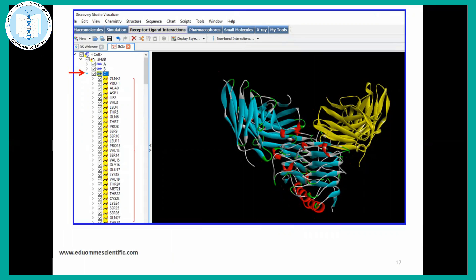In chain C, if you want to further check what amino acids are present, you can also get these detailed information from here.